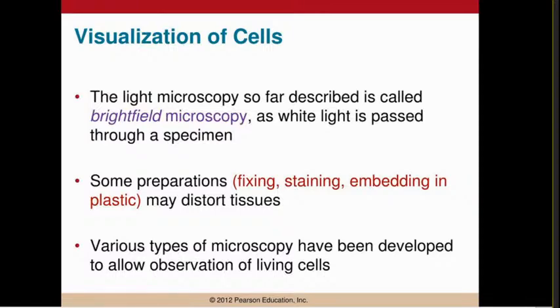If you take a cell and want to view it in a live form, we take the sample, pick it out with a clean sterilized tool, that may be a spatula or a toothpick. After the sample collection, we need to fix the sample on the slide. If you want to find out what happens in the live state, there is no need to add anything. Just keep the sample on the slide and visualize it under the microscope. It's a basic experiment.